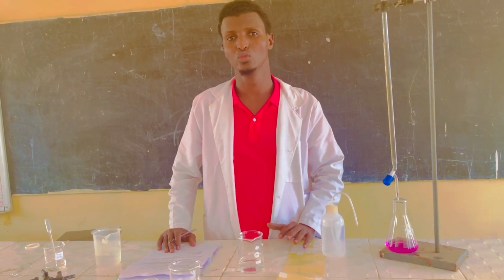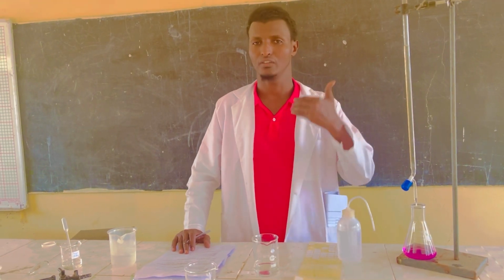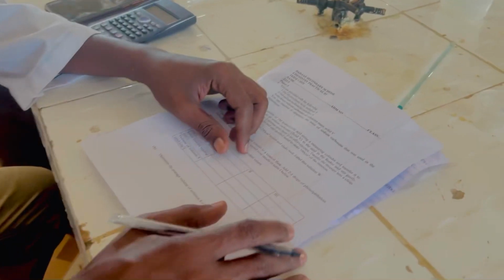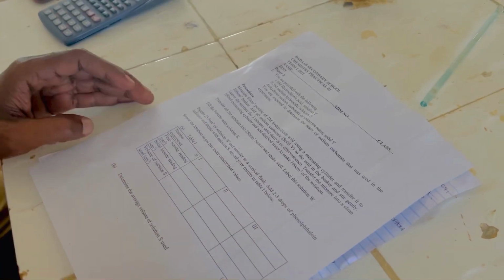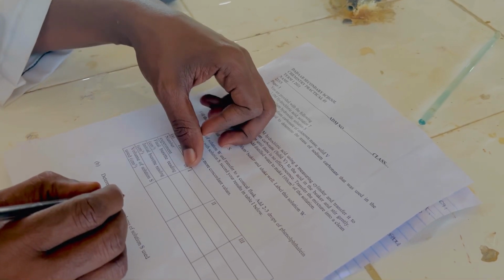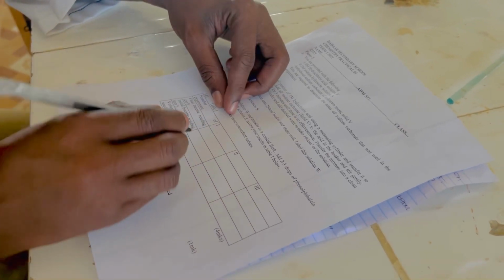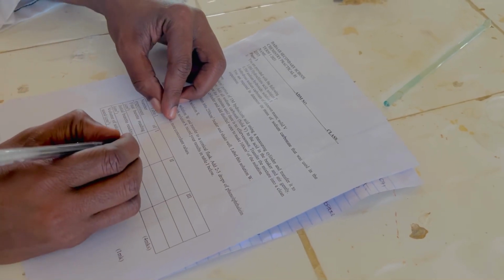And I'm going to do the questions. And before the questions, I will fill the table. After filling the table, then I will do the questions. I will start from an initial burette reading of 0.0.